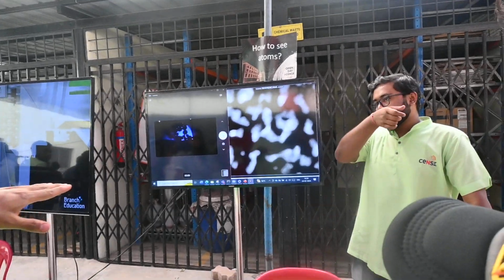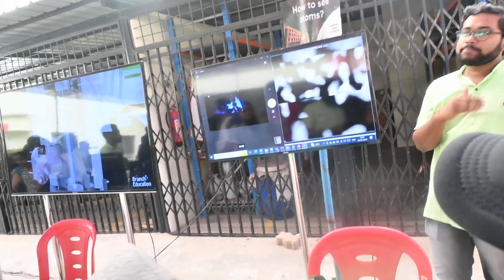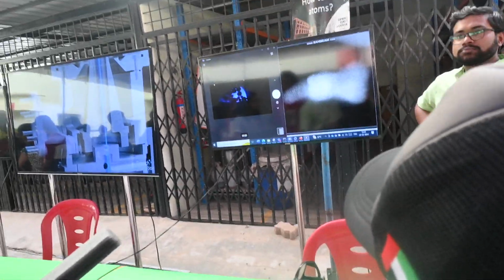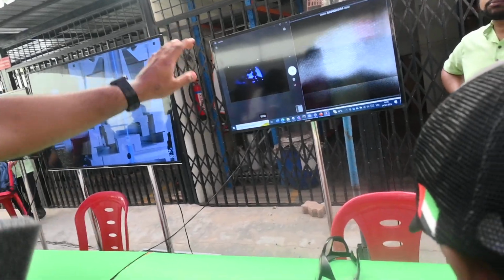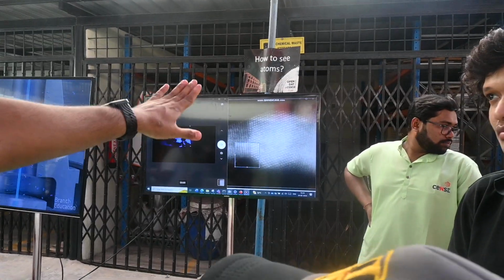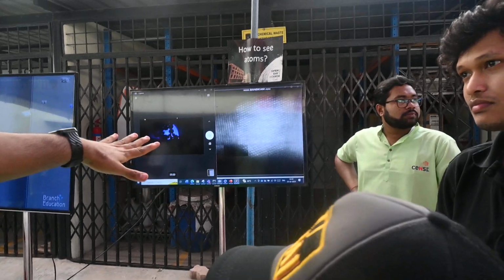And the electrons will be all around, right? Actually, the electron is passing through it and then giving out. That's gold's electron. But look, this is the sample interacting with the beam. This is one of the best parts. So you can clearly see all the atoms around, the full proper lattice.